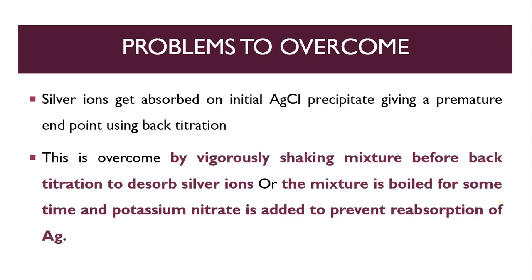A problem to overcome: the silver ion gets adsorbed on the initial AgCl precipitate, giving a premature endpoint in the back titration. If silver ions are surrounded by the AgCl precipitate, it will give a wrong endpoint. To overcome this problem, the mixture should be shaken before back titration.